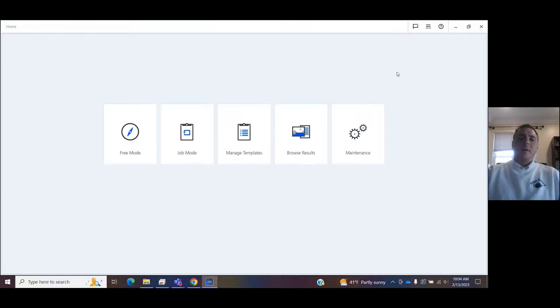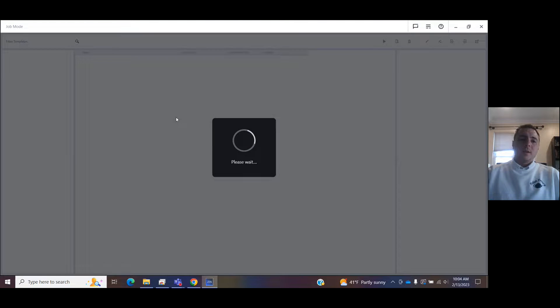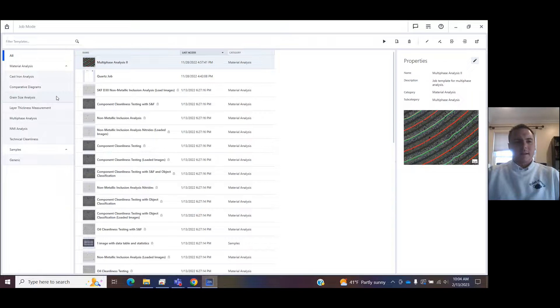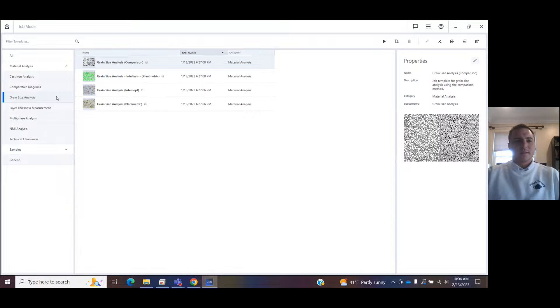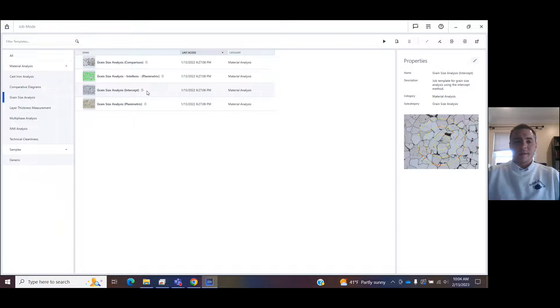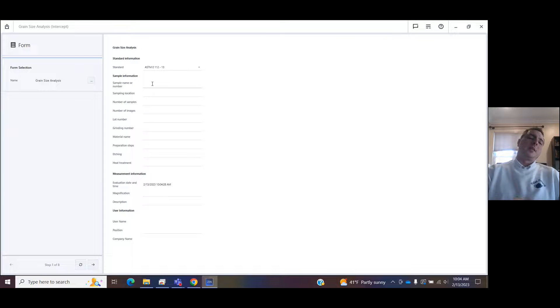Here we are on the homepage. I'm going to go to job mode. Once I click on job mode, I'm going to come over here to grain size analysis. Now you have options for comparison, planimetric, and intercept measuring grain size analysis. We're going to do intercept today.